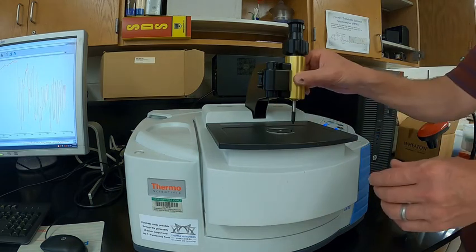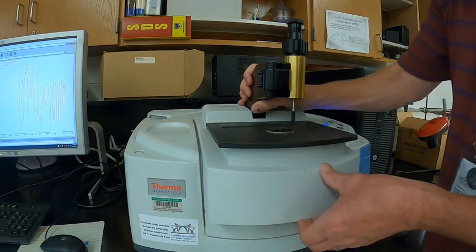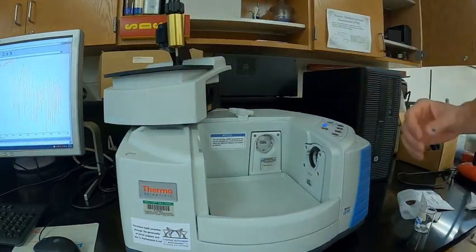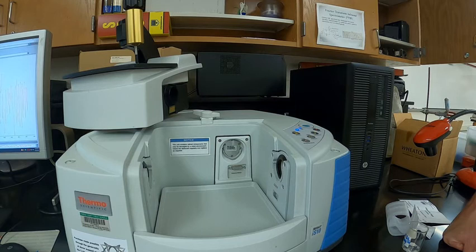If we were doing a different sample interface, I'll go back to the main chamber. If we did a different sample interface in here, now it's a little bit trickier to clean it because I don't want to get any water in there, and that's because water would dissolve the salt optics, and that would pretty much ruin the instrument.